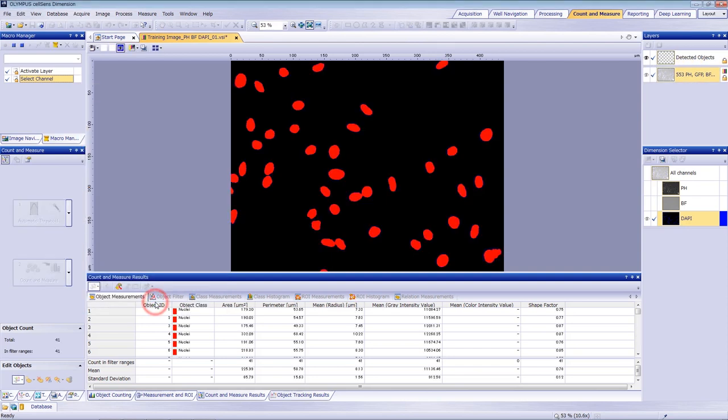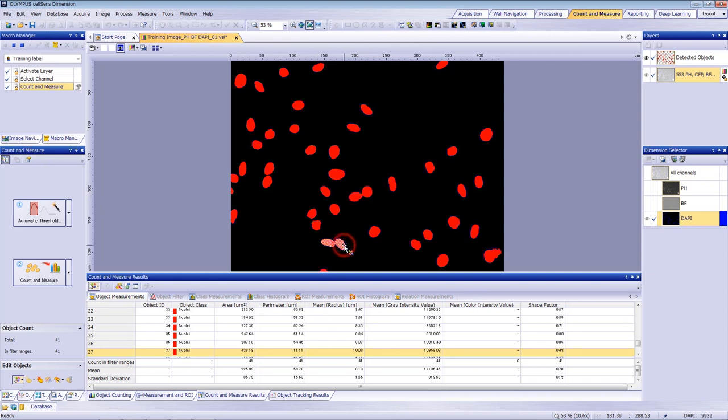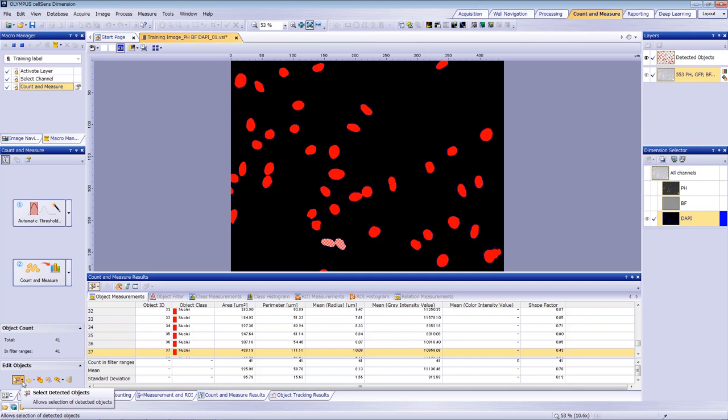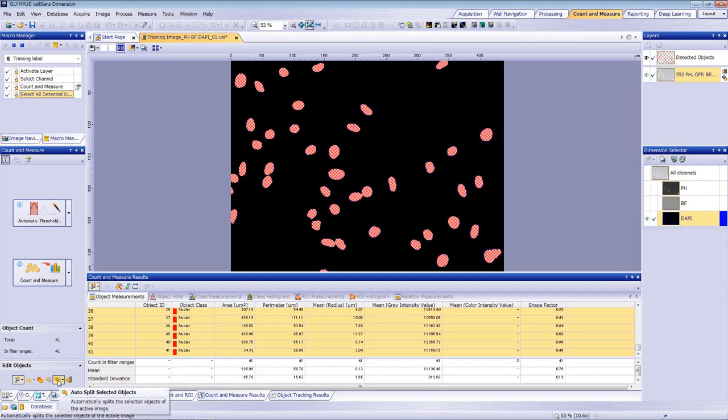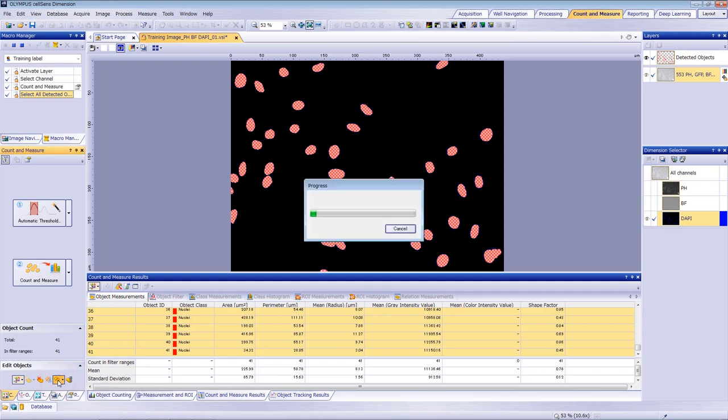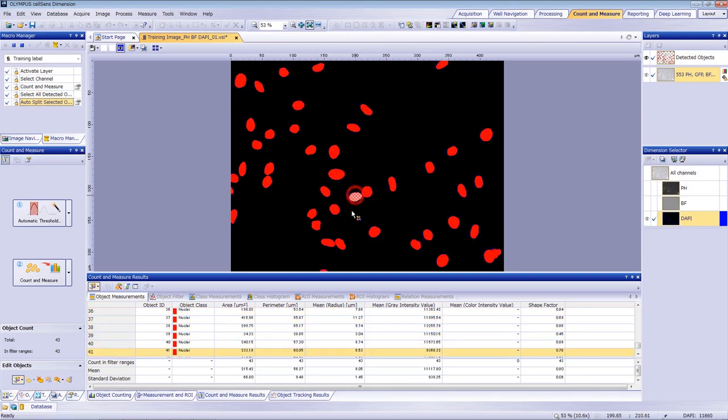The nuclei have been detected in red. If two nuclei are located close together, they are sometimes detected as a single nucleus. When this happens, you can tell the system to automatically split these into two objects. Click Select all detected objects and then click Auto-split selected objects. Confirm that the objects have been split properly and then stop recording the macro.